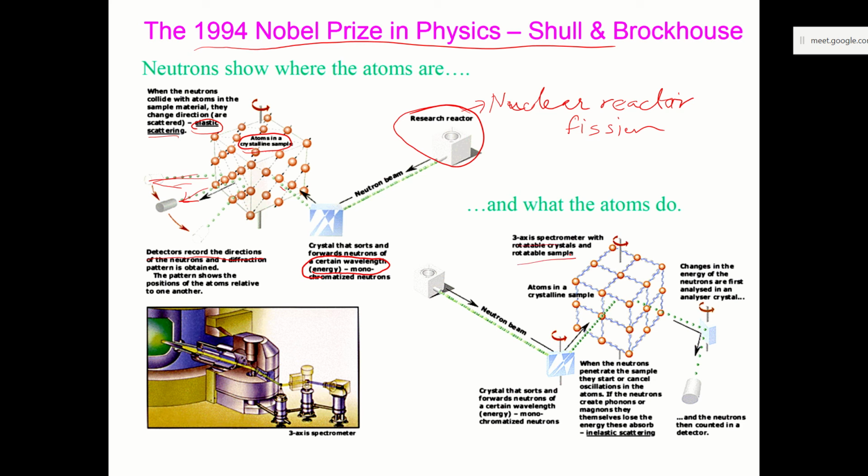There is a spectrometer. In the spectrometer, the sample chamber is such that the crystal is rotated. On rotation the 2 theta value changes, so one by one you can get the signals at different 2 theta values, where constructive interference occurs.